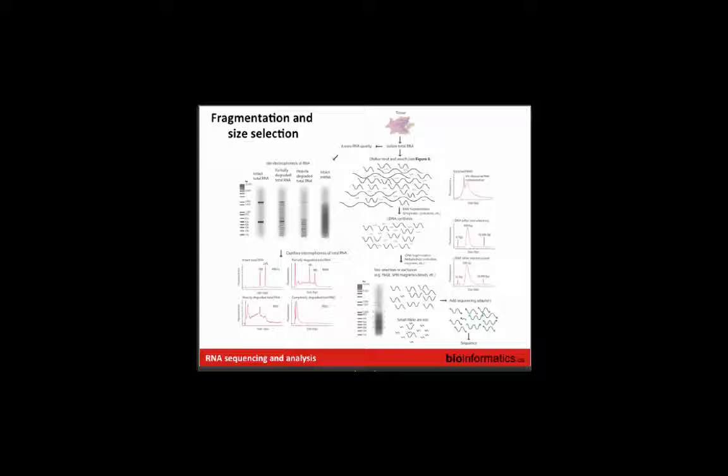And that's what's depicted here. You have this size selection or just size exclusion. The main difference is that you get a bit more of a tail of large things when you exclude just the small stuff versus specifically picking a band of a certain size. And then you wind up with the subject of your RNA-seq library that's going to have linkers added to it and will get sequenced. At this step, you're usually losing your small RNA. So if you want to do small RNA sequencing, you're going to have to capture these and produce separate libraries from the really small RNAs.